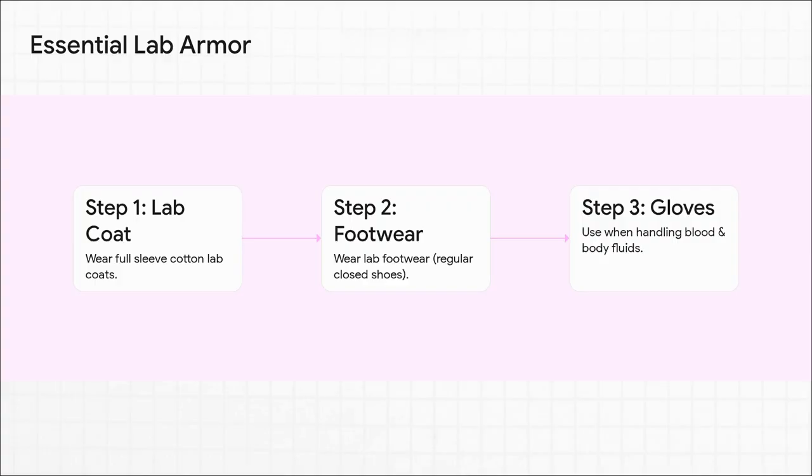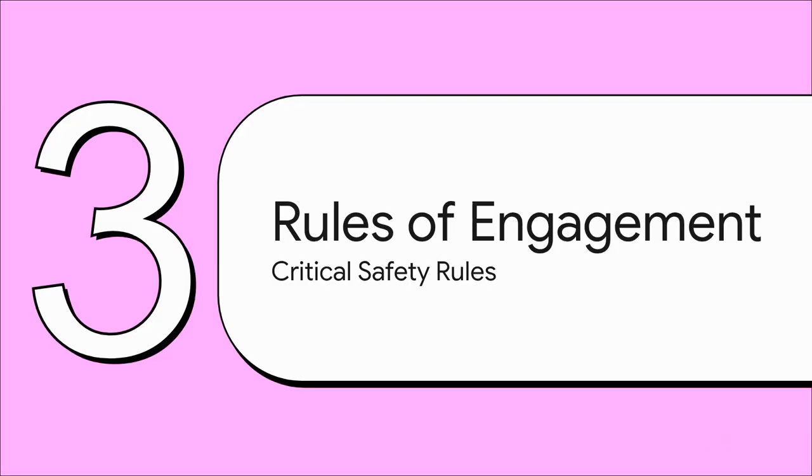Those closed-toed shoes, they're the difference between a minor cleanup and a shard of broken glass in your foot. And gloves, they're the only thing standing between you and that invisible world of pathogens and biological samples. All right, so wearing the right gear is step 1.